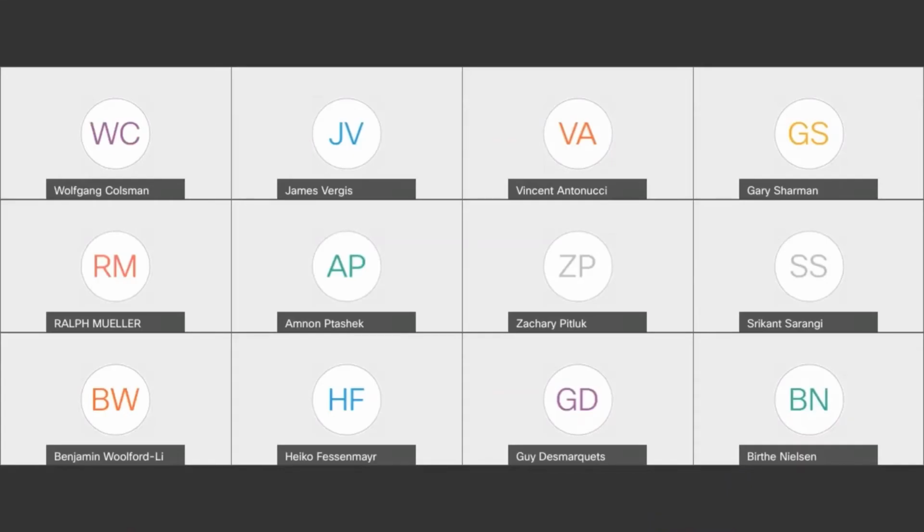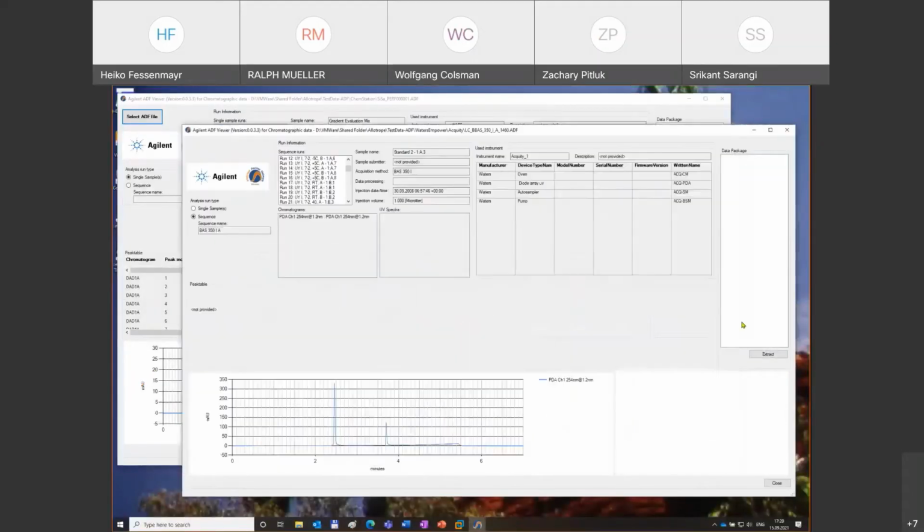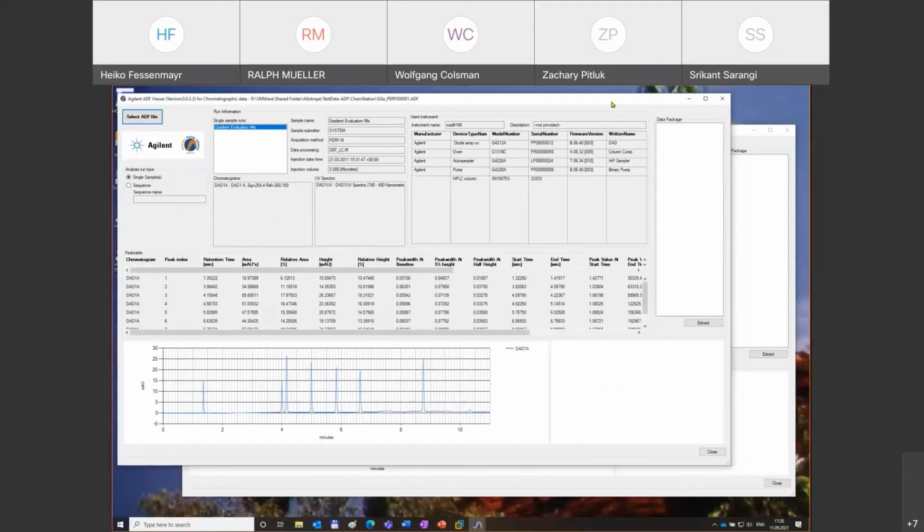So I will take over. Yeah. I won't show the overall process. I would like to show you the results that have been exported from the various processes.